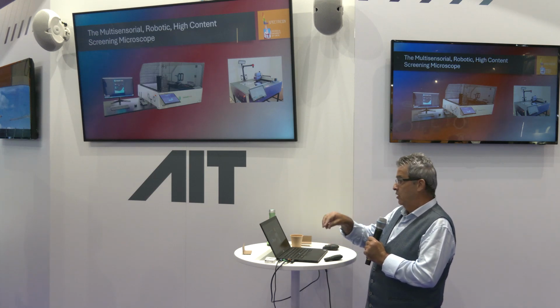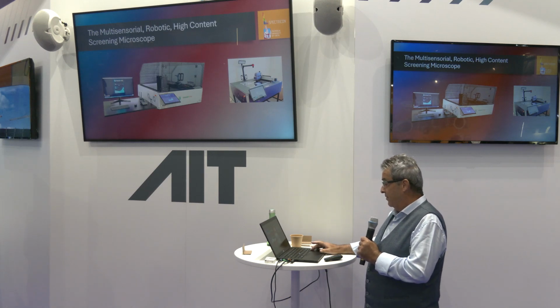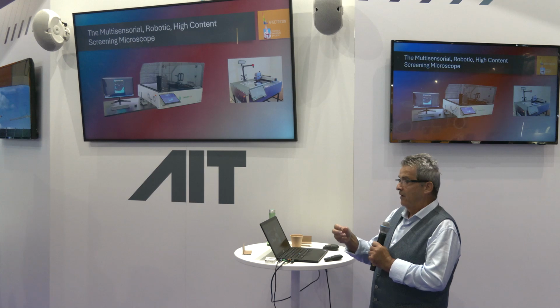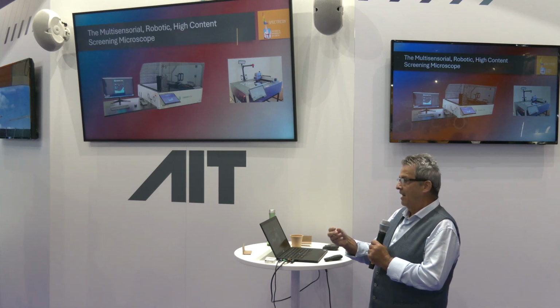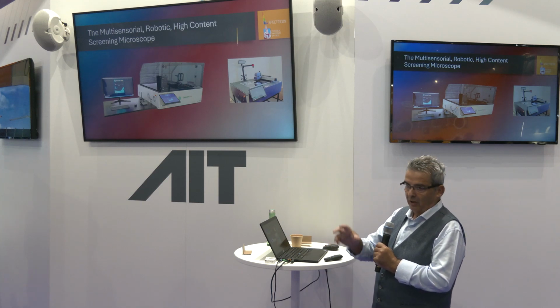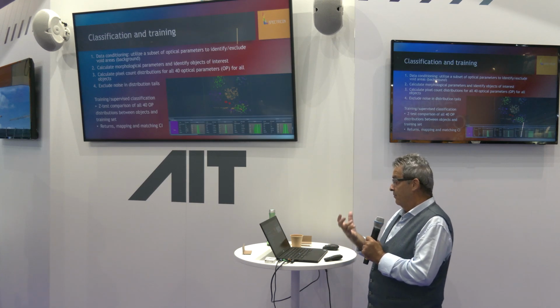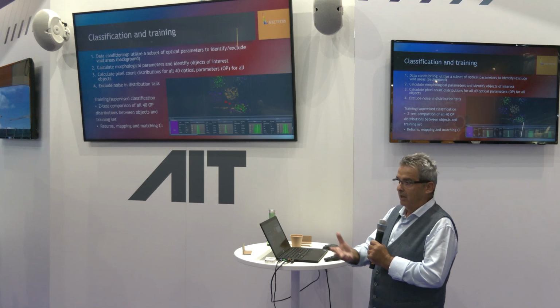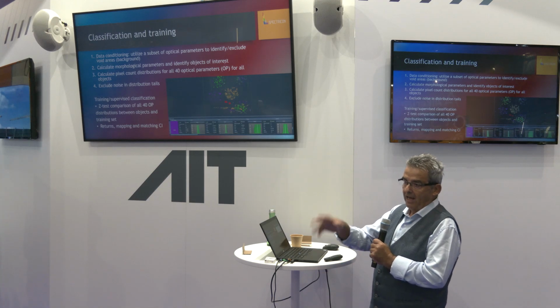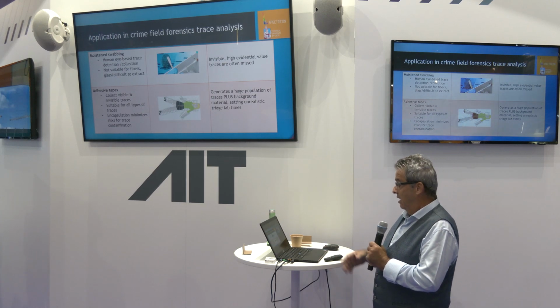So what it does, it goes in its particular field of view and captures all these 40 images, fluorescence, hyperspectral, and birefringence. All these images provide complementary information. It's very unusual for different materials to have exactly the same characteristics in all these imaging modalities, which give us, as I said, complementary information. And at the end, we are generating a training data set where, with ground truth material, these feature maps are correlated to particular chemical identity maps. This is an example.